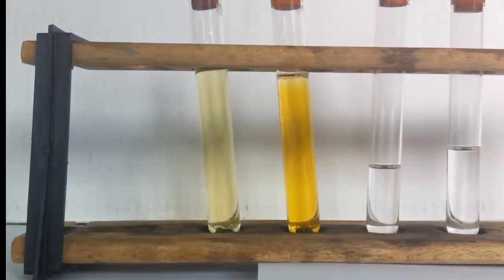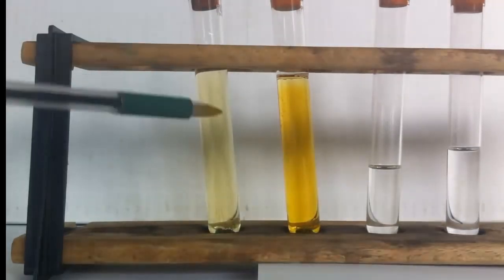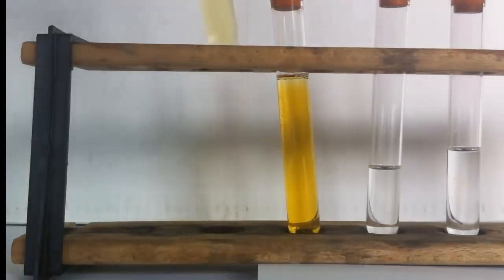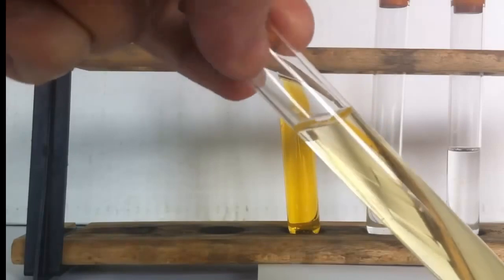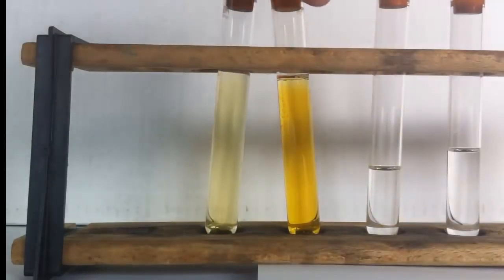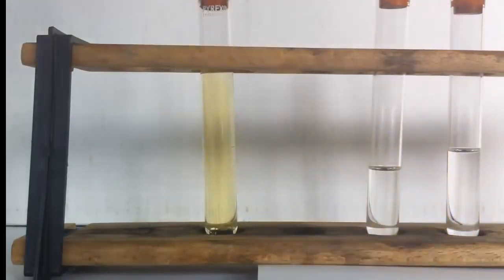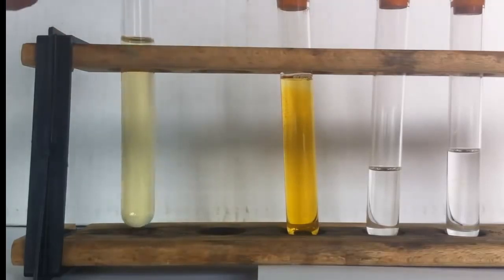Let's take a look at a test for unsaturation in hydrocarbons. On the left here in these two test tubes I have bromine water. You can see at low concentrations it appears more yellow than orange in color, and at higher concentrations bromine water appears orange as you see here. I'm going to use the darker solution so that it shows up better on camera.